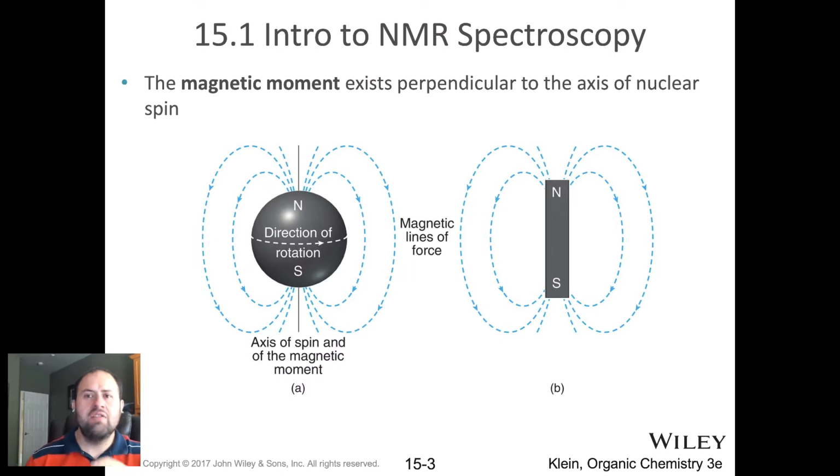Once again, the nuclei have spins, and these spins generate a magnetic field internal to the nucleus that acts like a little mini magnet. If you've ever seen demonstrations of magnetic bars and magnetism, you know that those fields can be manipulated. And that is what the radio frequency radiation is doing: manipulating them.